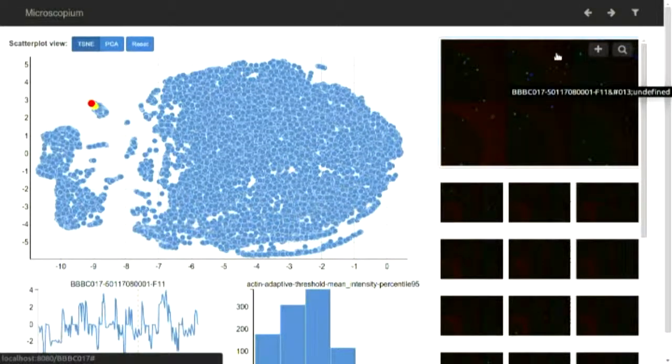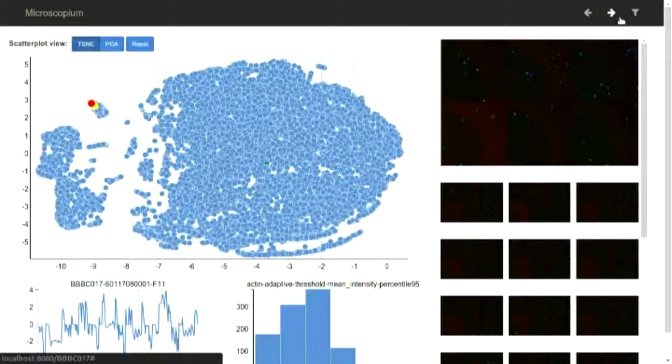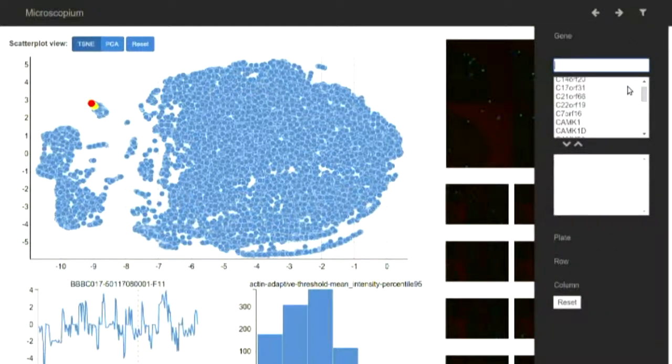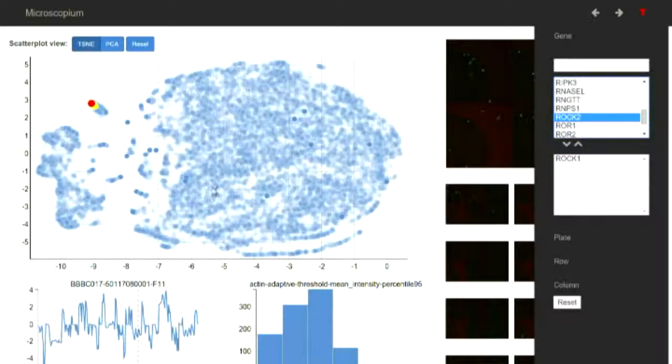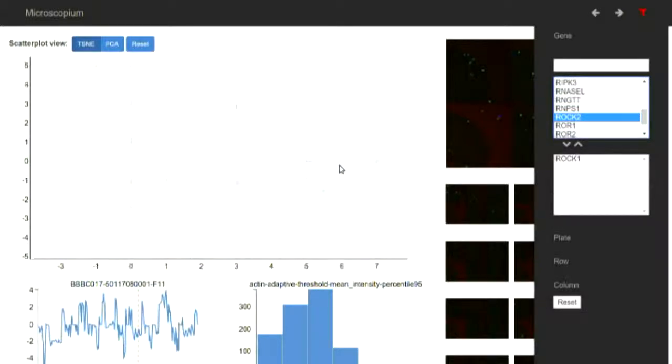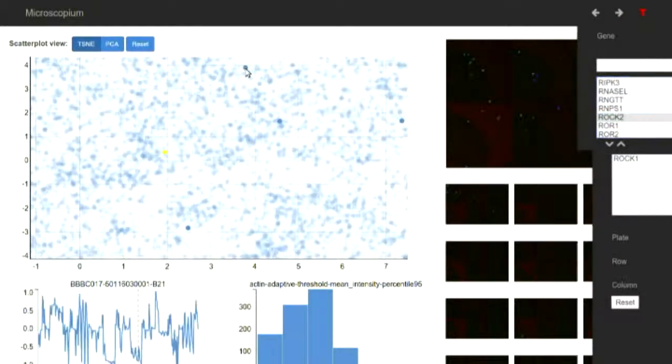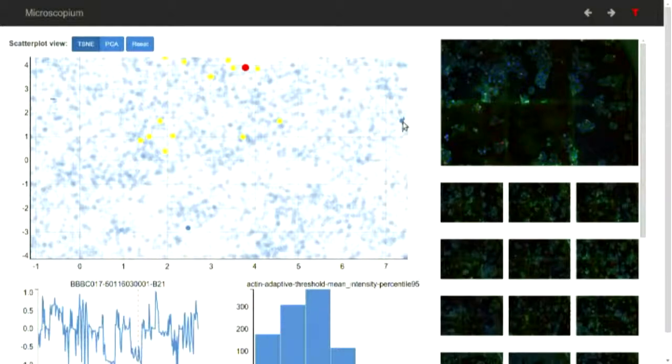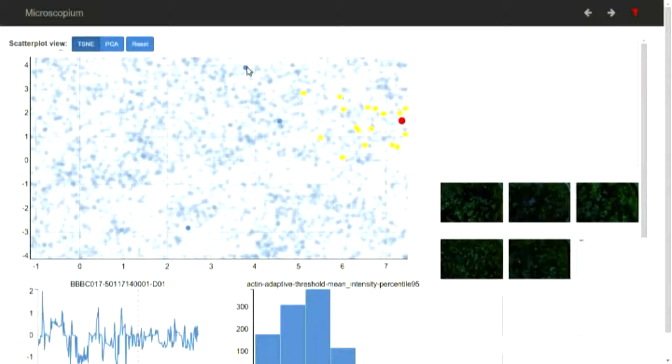We've also implemented a filter because one of our collaborators has a massive high-content screening data set and just had the question of if I tell you some particular gene that was targeted, are you able to just bring up all of the images according to that? None of the software that's used in high-content screening actually enables that. So we implemented this filter. Let's just say my favorite gene in the world is ROC1. If I add ROC1 to the filter, those points get highlighted in the scatterplot. I can click on those and immediately see what they actually look like.